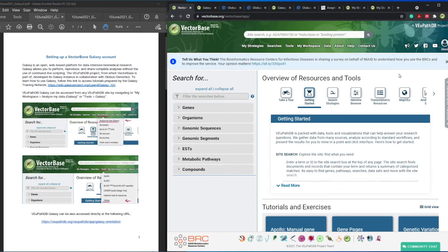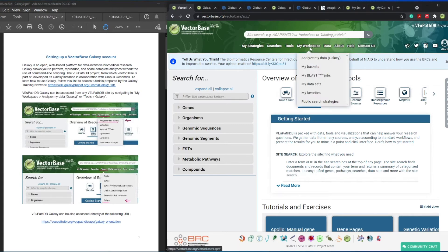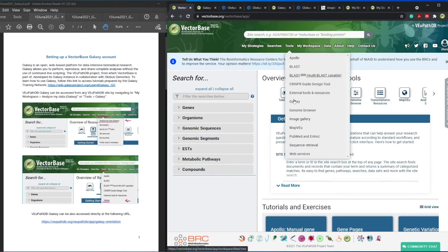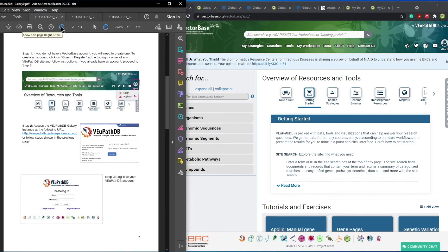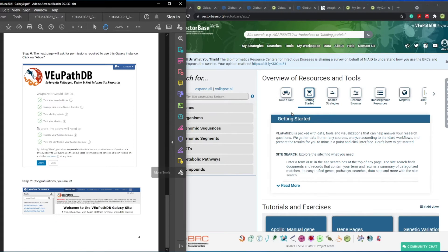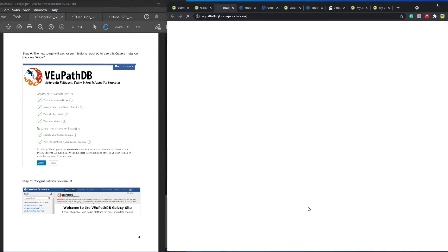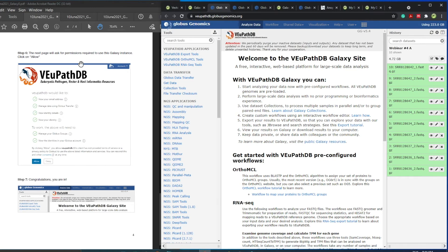I have three handouts for you today. The first one walks you through how to set up a VectorBase Galaxy account. You can have an account in any of the websites, for example VectorBase. Once you create your account, you can access Galaxy by going to 'My Workspace' and clicking to get to Galaxy, or via 'See our tools.' This handout gives you a step-by-step process of how to set up that account for the first time. You don't need to do these steps every time, only the first time. Once you do them, every time you click on Galaxy it will come straight to that page.